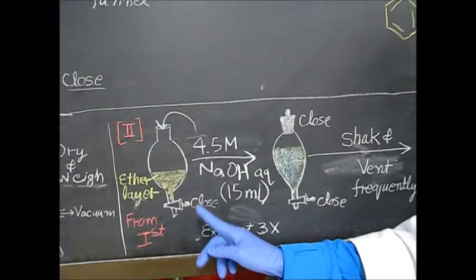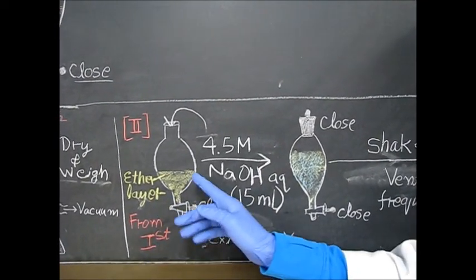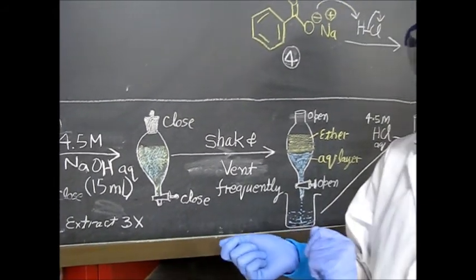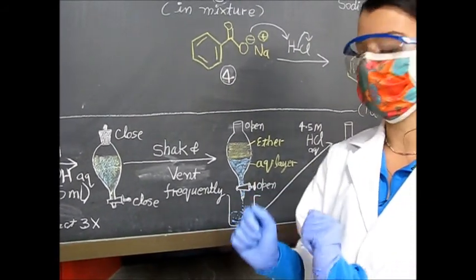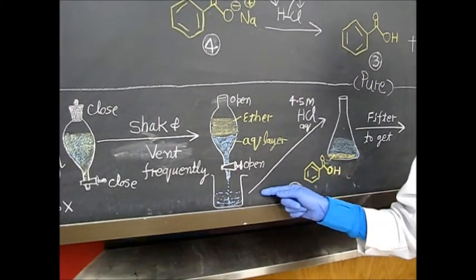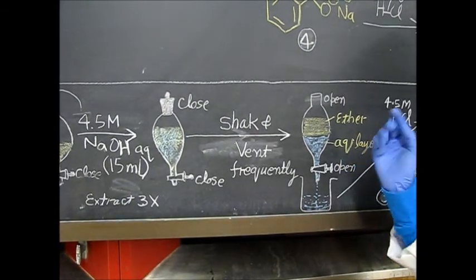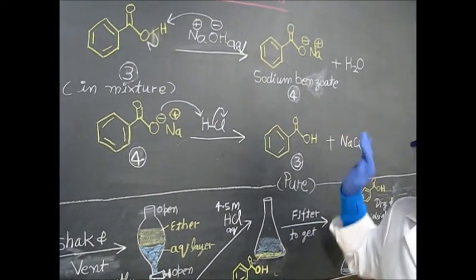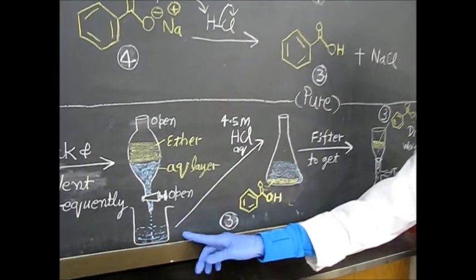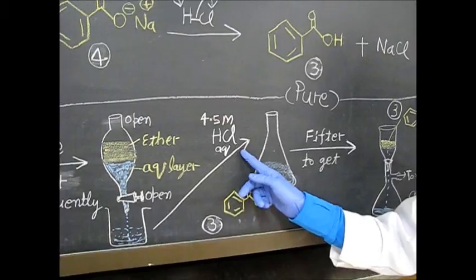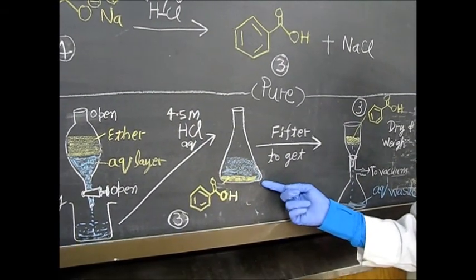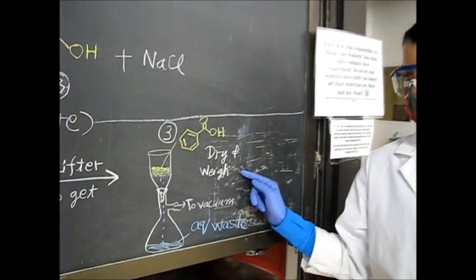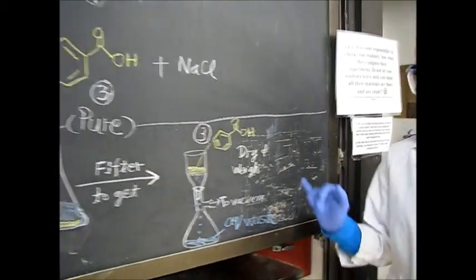In our separatory funnel, we will add 4.5 molar NaOH, 15 milliliters, and shake and invert the separatory funnel. Once shaking multiple times, we will separate out the aqueous layer and leave the ether layer. We will repeat this extraction two more times to ensure all of the sodium benzoate is created and separated out. After collecting our pool of sodium benzoate, we will acidify it with 4.5 molar HCl, which will leave a precipitate at the bottom of our flask. We will then filter, dry, and weigh the precipitate using vacuum filtration.